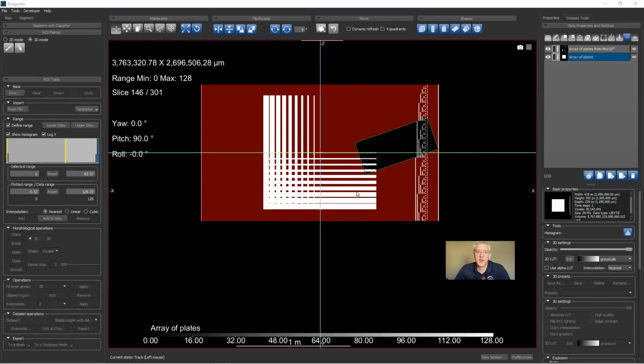So if I am 10 meters away from my subject and I take a picture with a camera, that distance does not tell you how big the pixels are because I may be using a magnification or a telephoto lens. So it's a complicated question, but the short answer is no, the working distance is not a z-axis. There is no z-axis in a 2D image. There is no z pixel size in a 2D image. You're only imaging surface effects. If you want, you can ask me that question offline and I can give you some more detail.